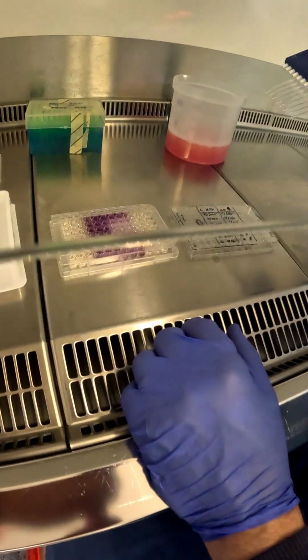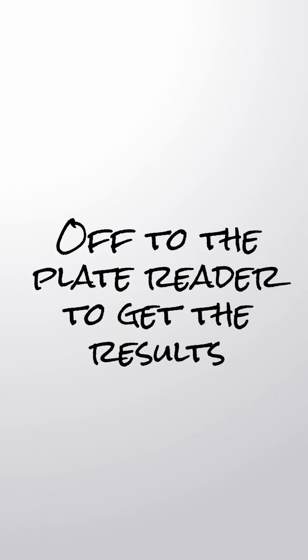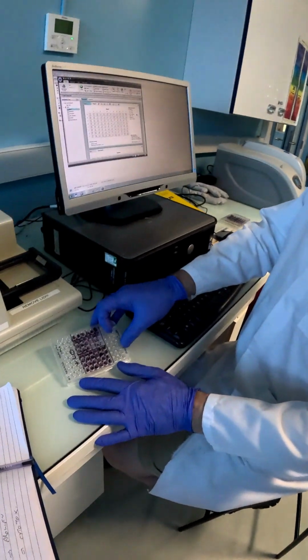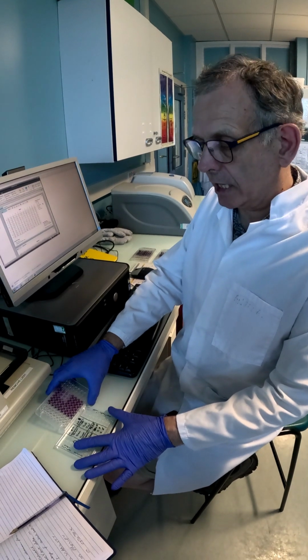And what we can clearly see is a nice purple colour that's been solubilized from those crystals. So finally guys, we have the plate, and this has been solubilized, and we've got a nice purple colour showing from solubilization of those formazan dye crystals.